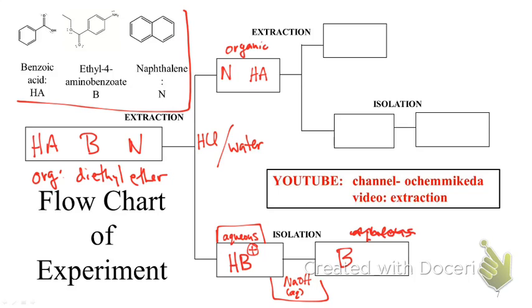Should it dissolve? We're in a water environment. What did you say about the solubility of compound B? We would expect it to precipitate. Okay? So what you'll see when you do this experiment properly is you'll see a precipitate come out of solution. Okay? That would suggest that you did everything correctly and everything should be good and happy. So that precipitate then is, again, an organic base? That would then be back to our organic base.